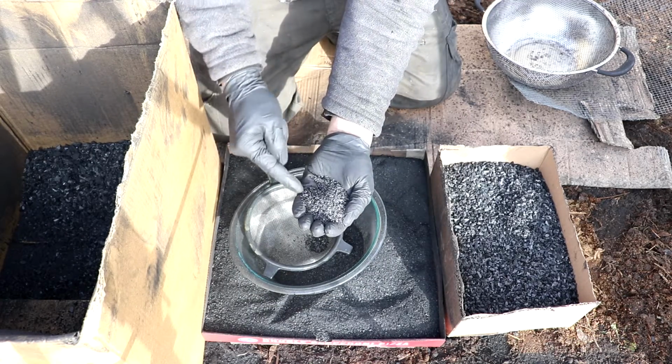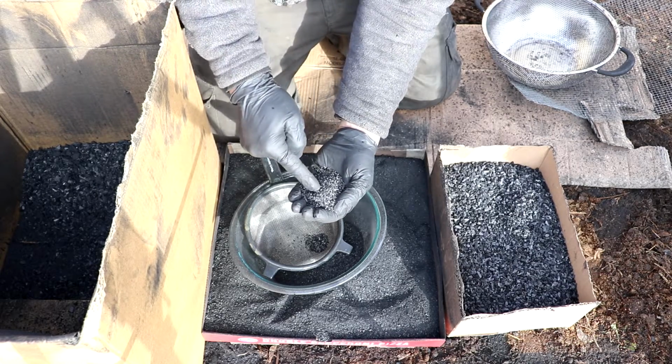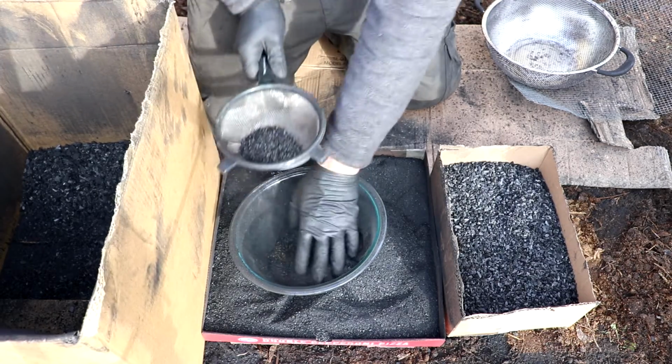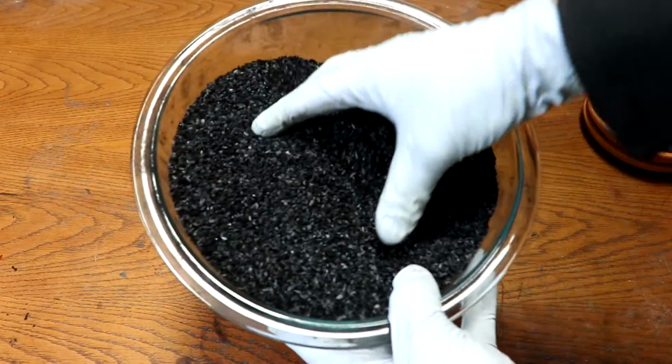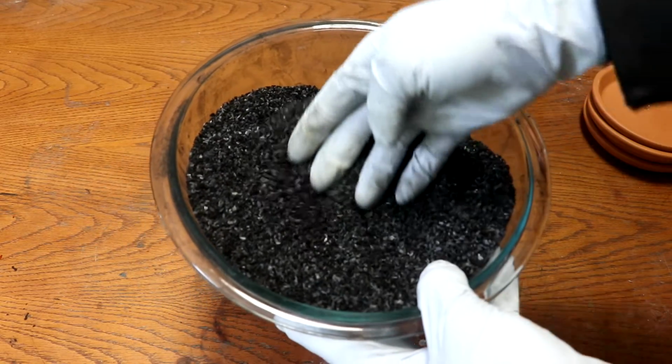And now, since the particles are all about the same size, their packing efficiency is decreased, and gas can easily pass through them. So I'll just finish this up. So here's my crushed and screened charcoal. All of the pieces should be roughly the same size.